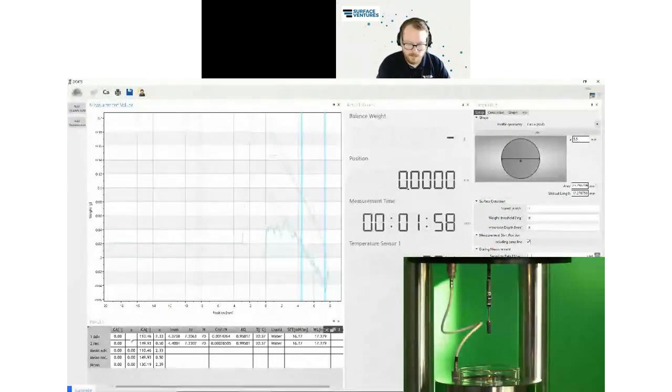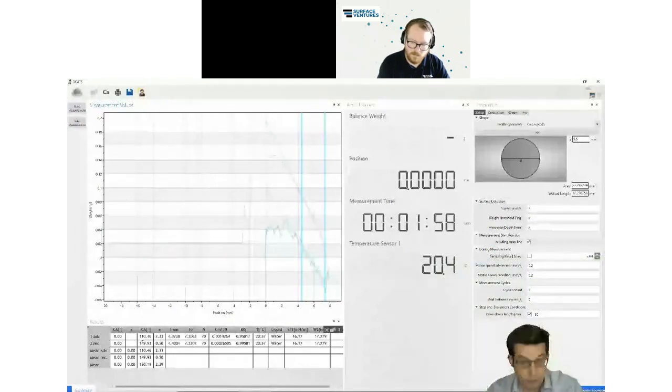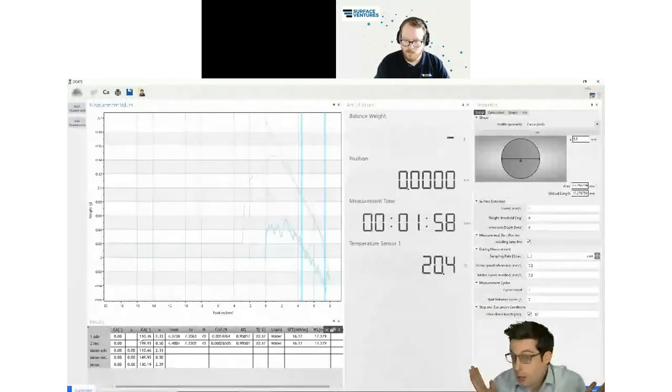What you see now is, in the first column, we have a contact angle of 0, both for the advancing and for the receding. This means this is a hydrophilic implant. But the interesting thing is that here we are getting an imaginary contact angle, in this case of around 110 degrees. And this is the interesting point. If you had analyzed this implant with a classical method, only using real values for the contact angle, you would get a contact angle of 0.